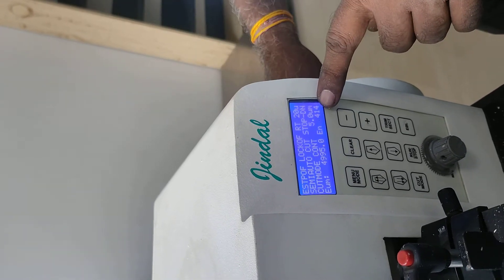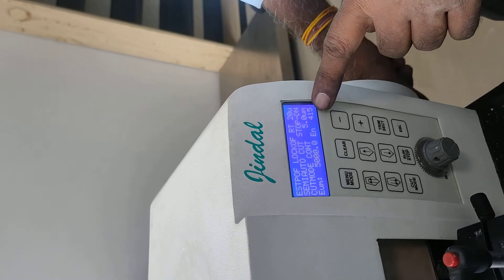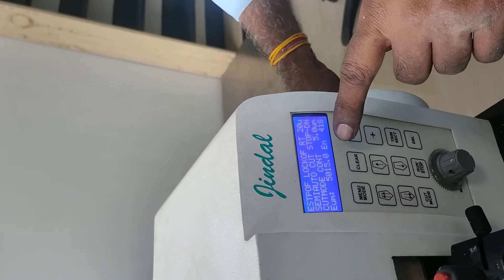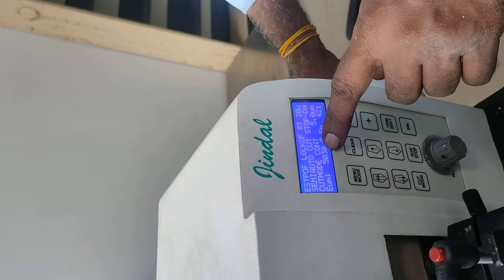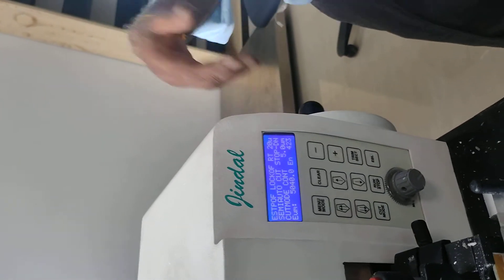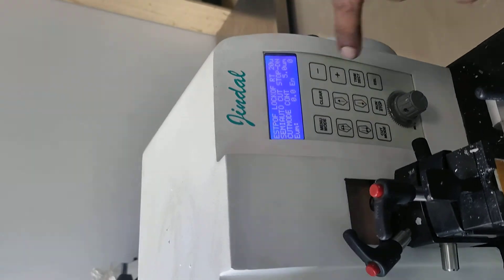Now we have to check it — it will be 415, then 416. We have to track the total cuts. How much cut is it? 25, 30, 35. This is the total. How many microns have been cut? That will come. If you have to clear it, you will be able to touch it from here and it will be clean.